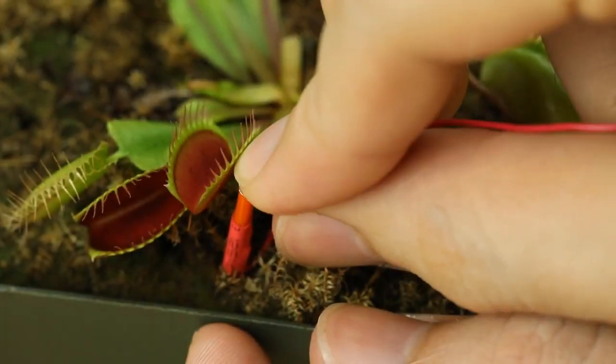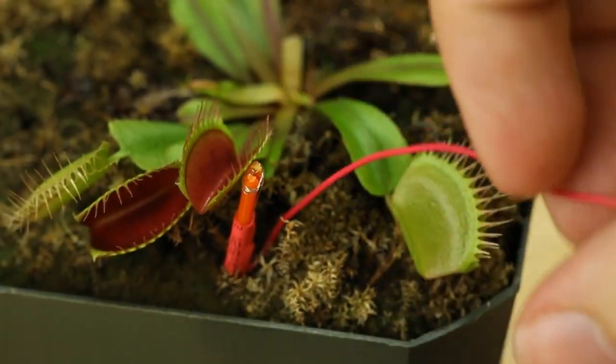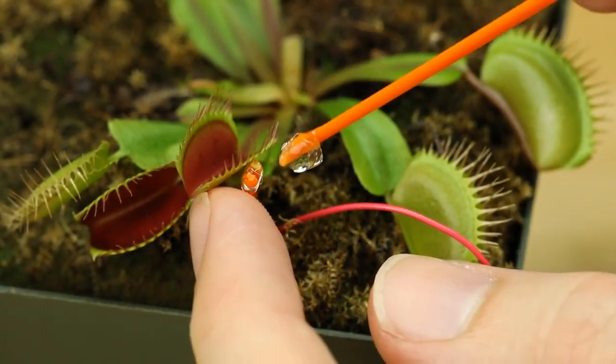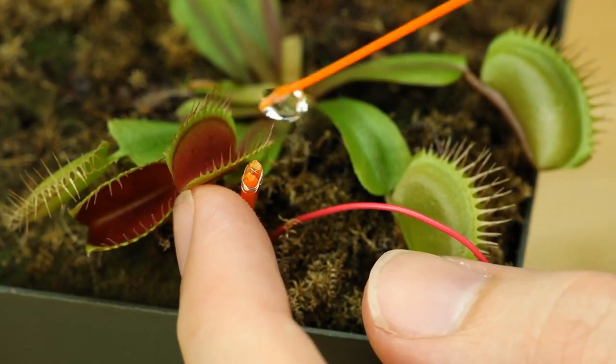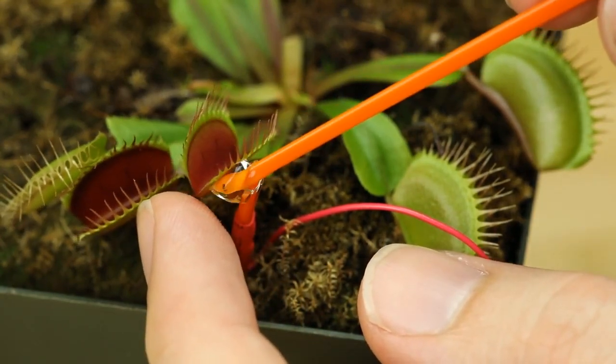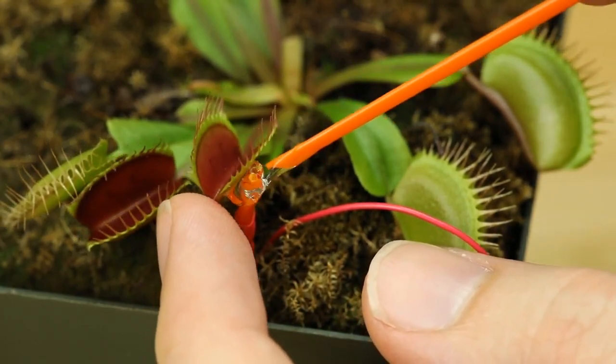Following this, you'll similarly place the orange recording electrode stake beneath the Venus Flytrap, and also add a little bit of recording gel to complete this connection.